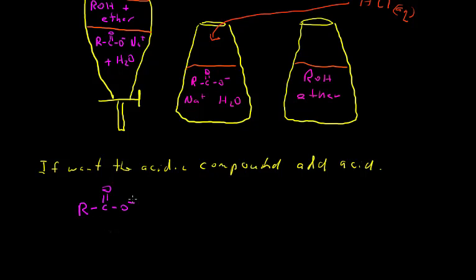So there's the carboxylate anion. We add our HCl. Remember, that's the sodium salt. I left the sodium out. It's a spectator ion. In an acid-base reaction, this anion is going to pick up that proton from the hydrochloric acid. Remember, the hydrochloric acid really exists as protons and chloride in the aqueous solution. And that neutralizes, reforms our carboxylic acid. The chloride will pair up with the sodium, and so that's our new salt. And this is again a proton transfer Bronsted acid-base reaction.